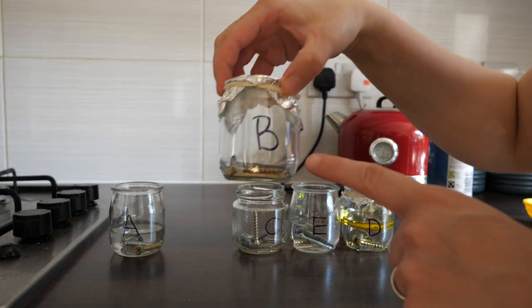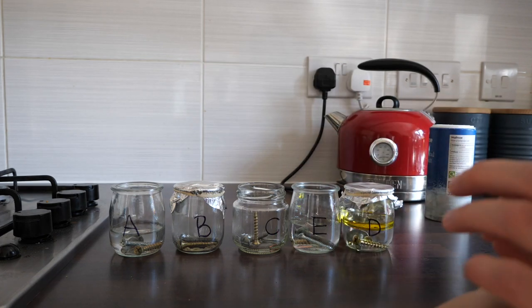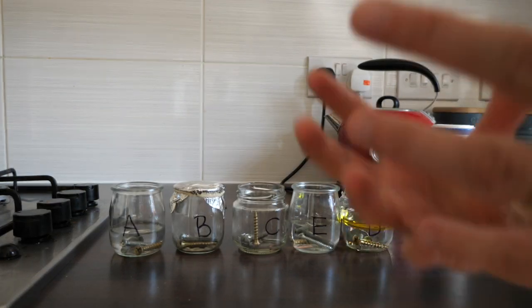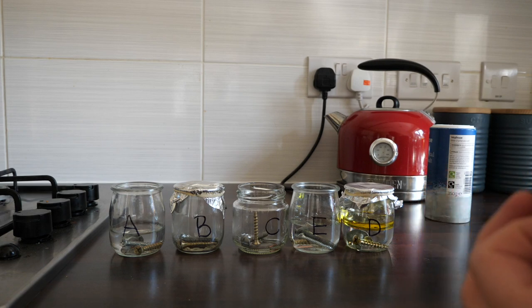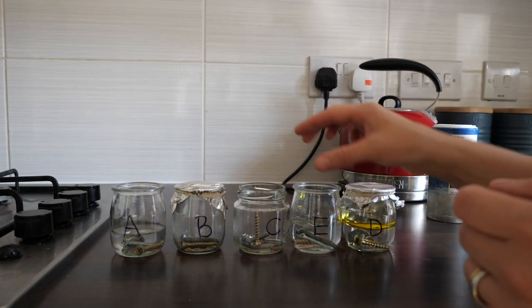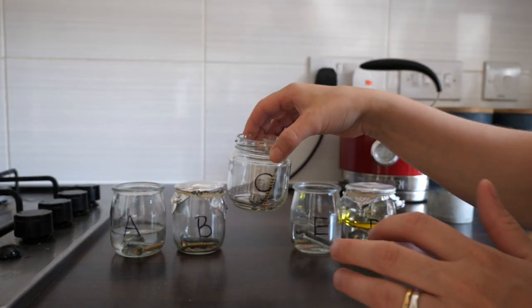Into B I've put my rice and then I've put a lid on top. The idea of the rice, as anyone who's ever dropped their phone in some water will know, is that it tries to absorb the moisture. If you've got one of those little packets of crystals that would be even better, but I've had to make do with rice. In C there is nothing — it's just the air around it and I'm leaving that open.